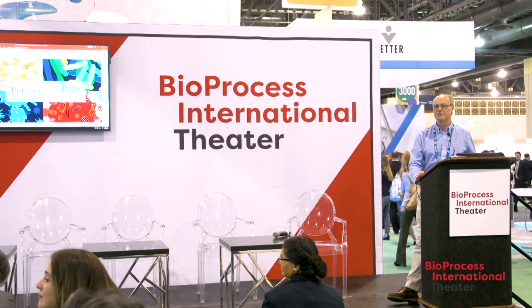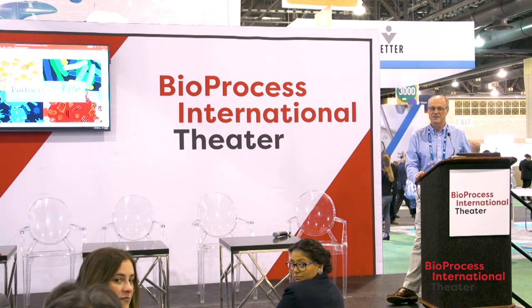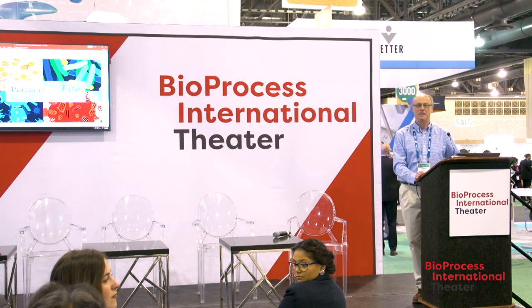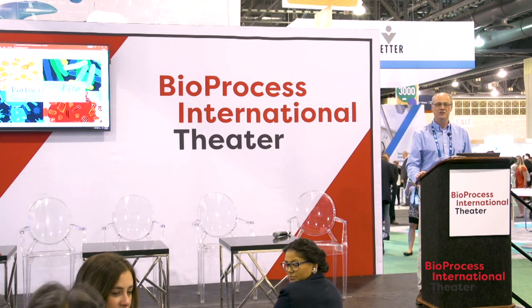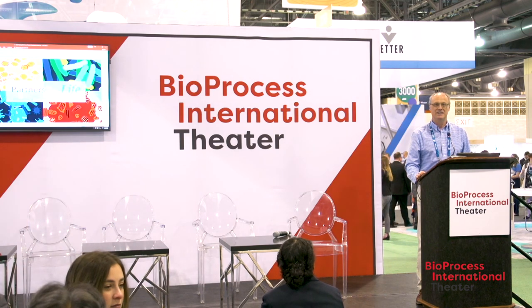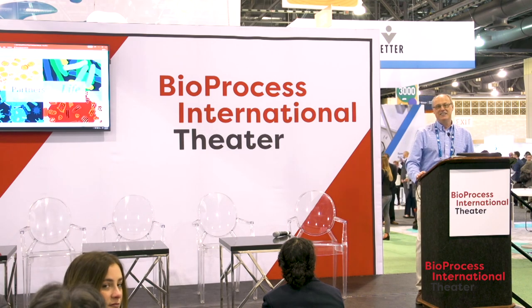Hi, from a process development perspective, how do you monitor the impurities on all these things? Because most of the traditional literature, everything is available on DNA, host cell protein. In virus being complex and the envelope and proteins, everything is going to be a goopy mess in that one. How are you going to monitor this in process development?